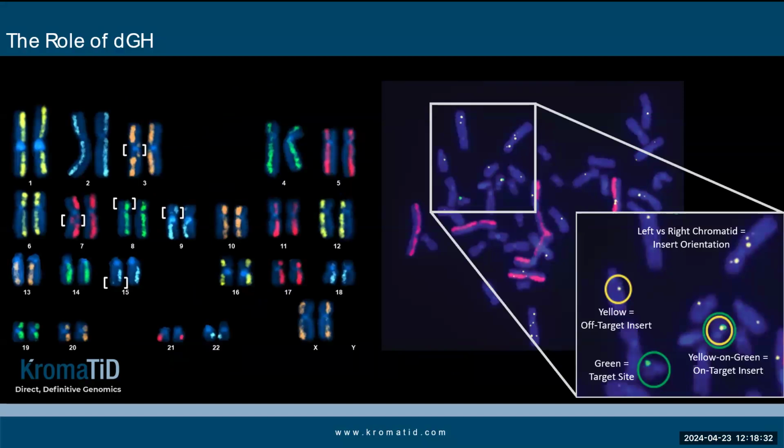Established cytogenetics methods enjoy widespread use, but many other technologies, such as sequencing platforms, offer valuable data. They vary in cost, technical expertise required, how laborious or time-consuming each one is, their reproducibility, and excluded sample types. However, DGH technology offers a unique view of the genome.